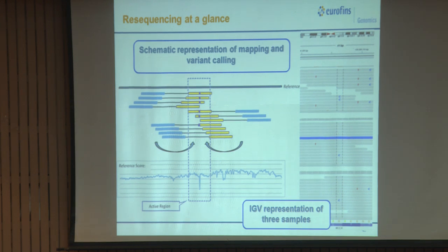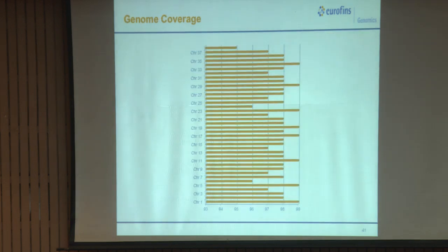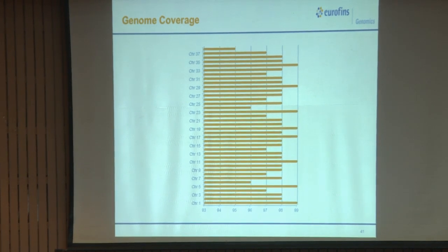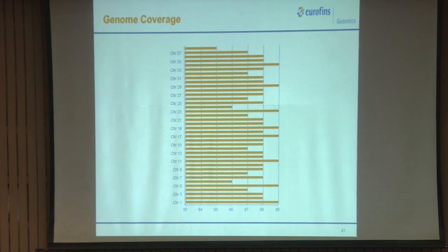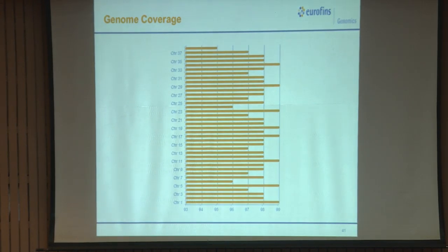If we have it chromosome-wise, we can identify my genome coverage per chromosome. If I only have one chromosome, I can identify how much is my genome coverage based on calculating the ATGC against the Ns. The more number of Ns, the lesser the percentage of coverage. That means that region I could not cover with the resequencing.